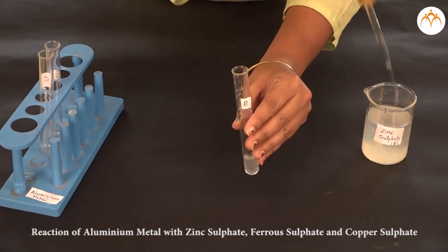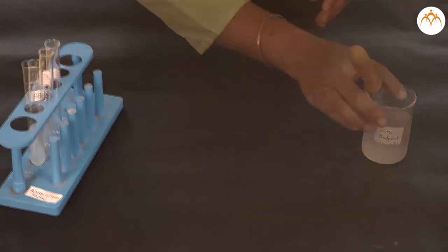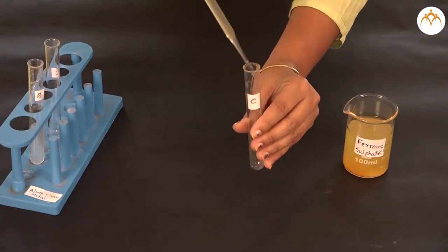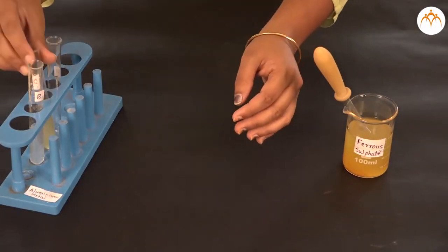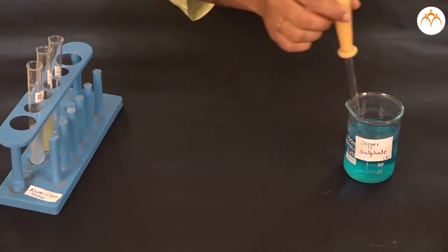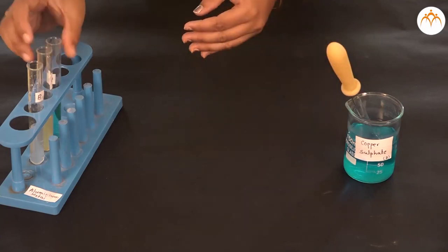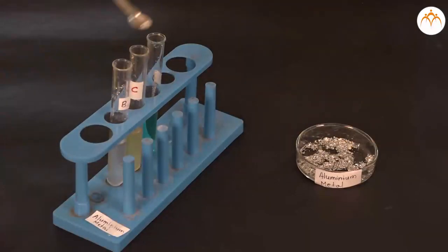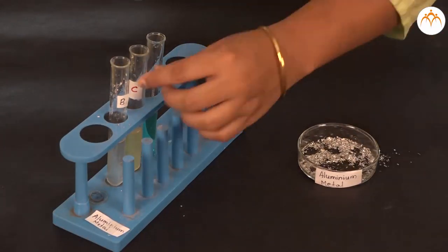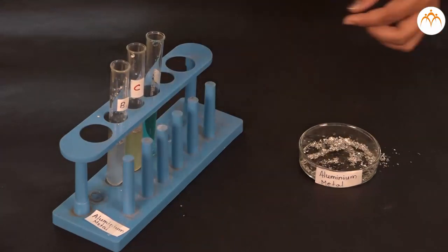Part A: Let us first perform the reactions for the metal aluminum. As aluminum metal cannot react with its own salt, we are going to take the other three salt solutions in test tubes. Add aluminum metal to all three test tubes and observe the reactions.